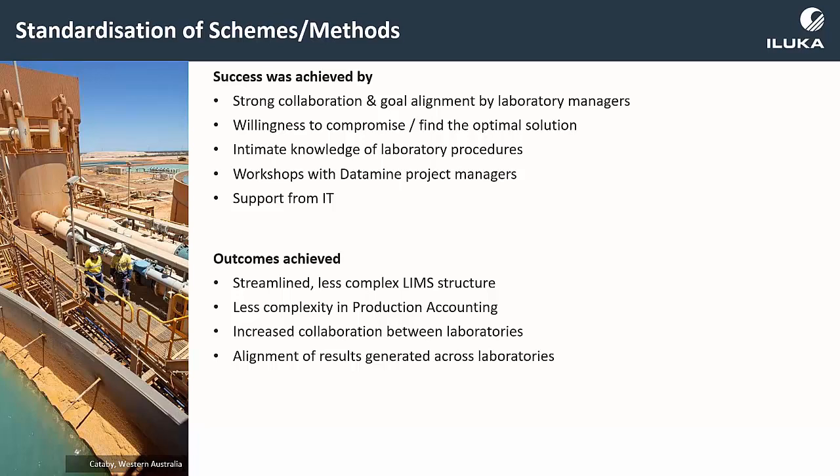We were able to utilise that information from Datamine and support from our IT. With a lot of the new analytes that we created, obviously they had to change in our production accounting system. So it was essentially when we upgraded or standardised our CCLAS, we also copied that standardisation across to our production accounting systems.